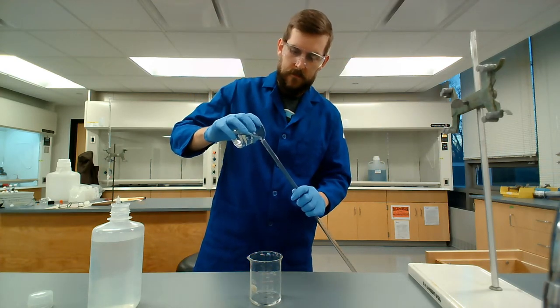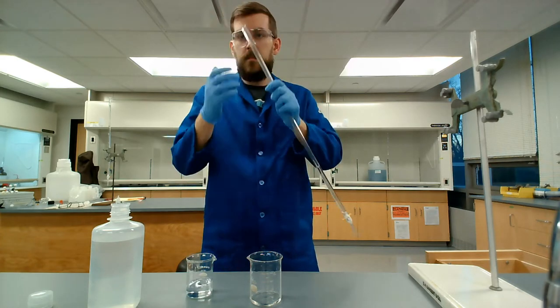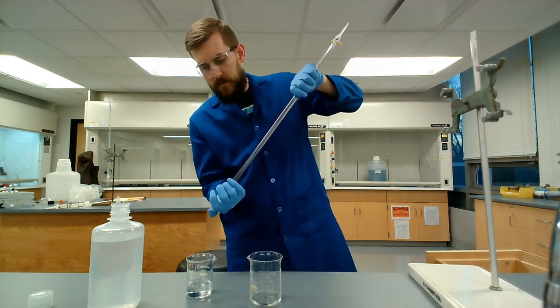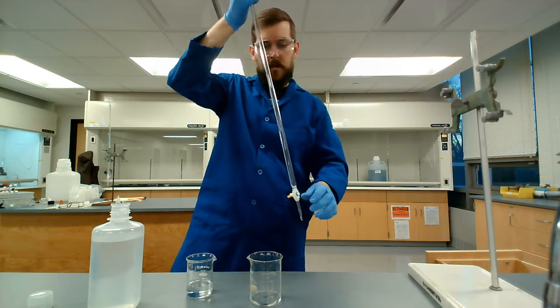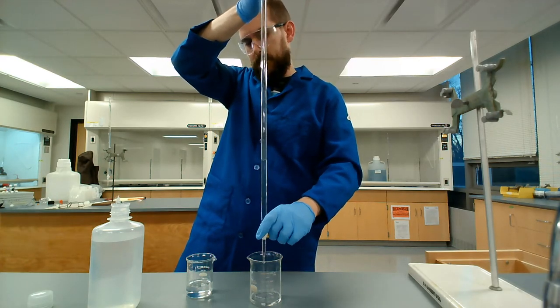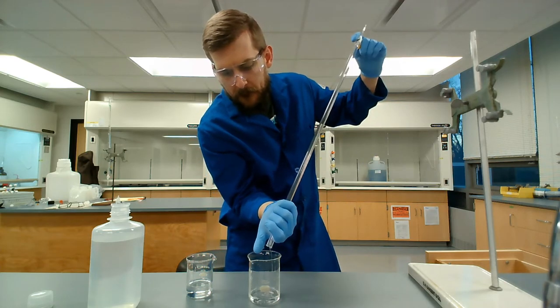Pour 5-ish more inches of sodium hydroxide into this thing. I'm overshooting a little bit. Anyway, cap it with my thumb, with my gloved hand, and invert it a few times to make sure all of the walls of this buret are coated with the sodium hydroxide solution that I'm about to put in. Right. Empty it out one last time.